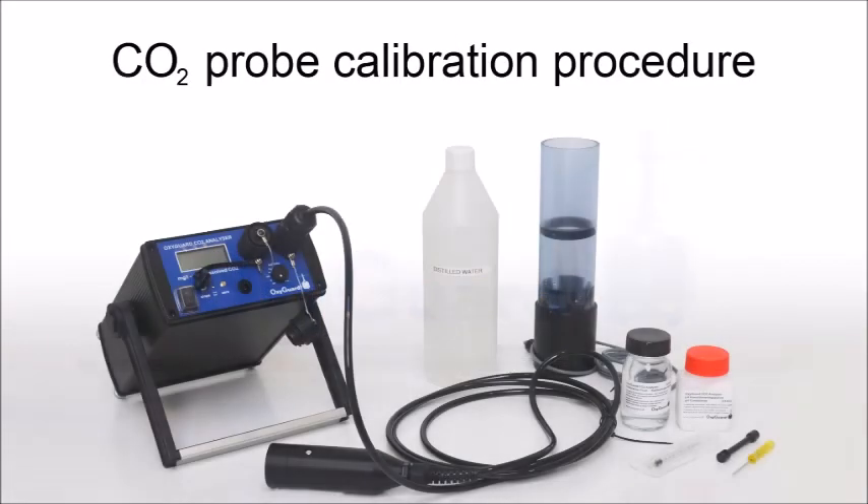This video shows you how to calibrate an OxyGuard CO2 probe. You will need the following items.